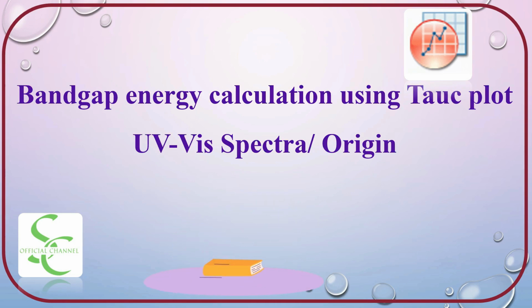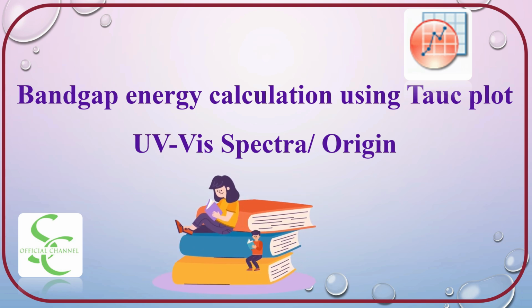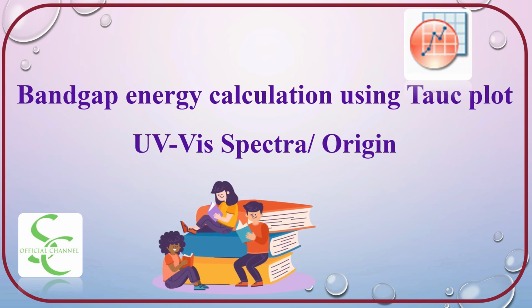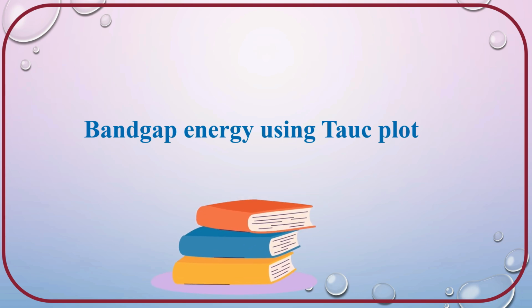In this video, we are going to learn bandgap energy calculation using Tauc plot in Origin. That is bandgap energy calculation using Tauc plot in Origin.